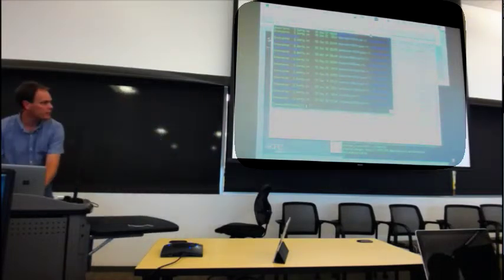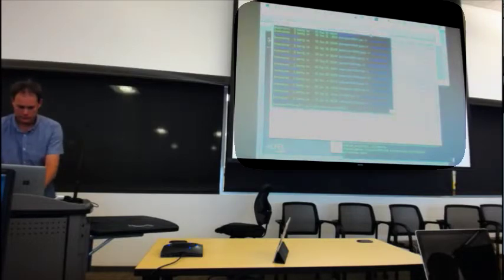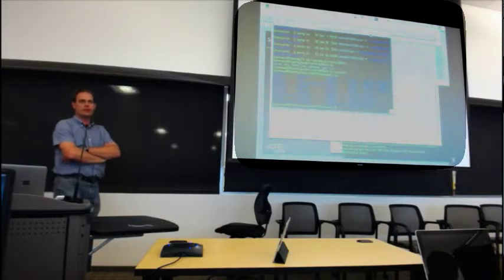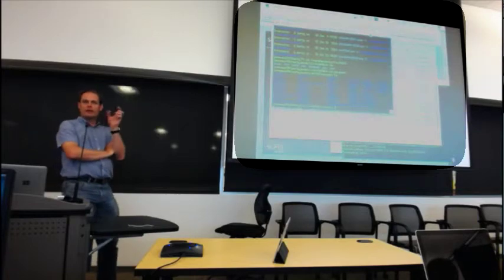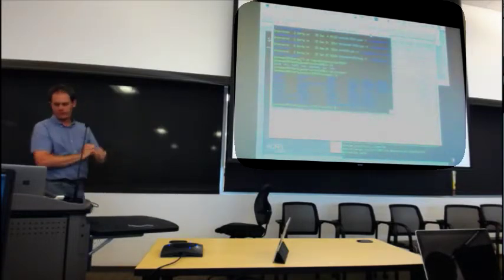You should really be doing something like cd /reg/d/psdm/cxi/cxi84914. Okay, that's the experiment directory on the faster disk systems, and you should go into Scratch there and be putting all of the output from the experiments in this Scratch directory, not in your home directory. Little bits of data in home is fine, but once you start processing this volume of data, you're just going to overrun it. That's what this Scratch space is for. Okay, so this output should all be going in there.